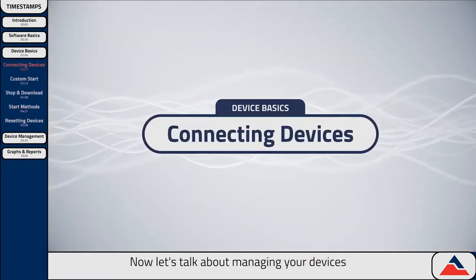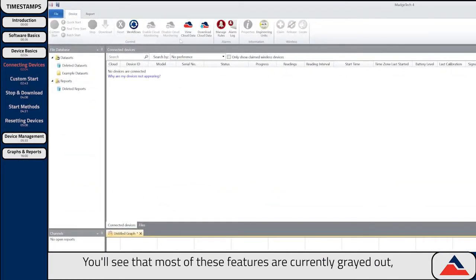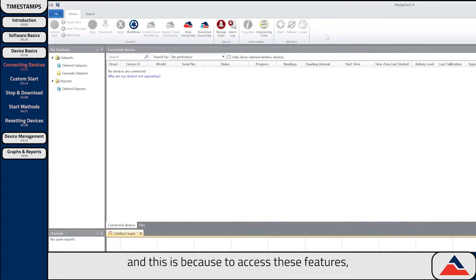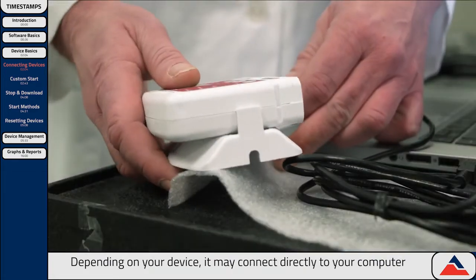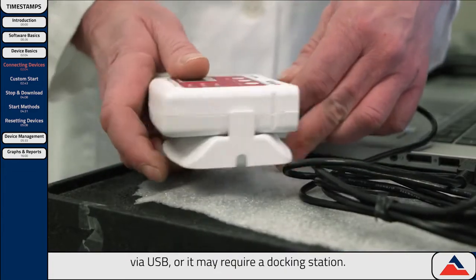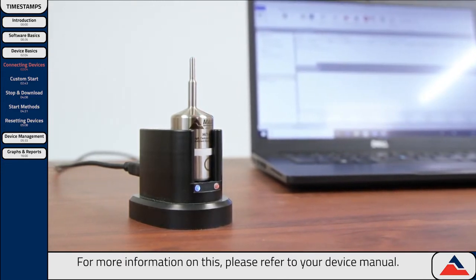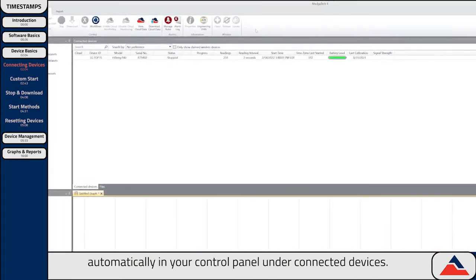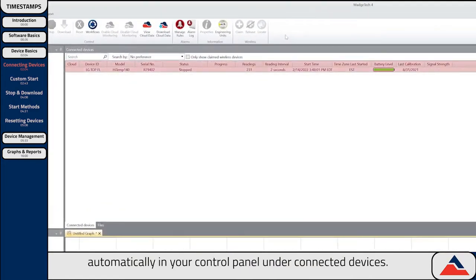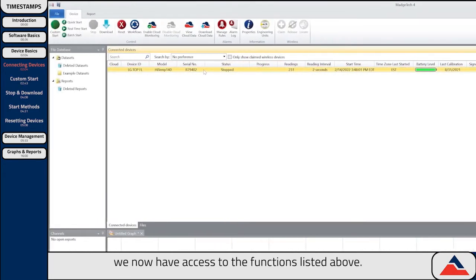Now let's talk about managing your devices and all the features listed under the device menu tab. You'll see that most of these features are currently grayed out, and this is because to access these features, you must first have a device connected. Depending on your device, it may connect directly to your computer via USB, or it may require a docking station. Please refer to your device manual for more information. Once your device has been connected to your PC, it will appear automatically in your control panel under Connected Devices. You'll notice after connecting the device, we now have access to the functions listed above.